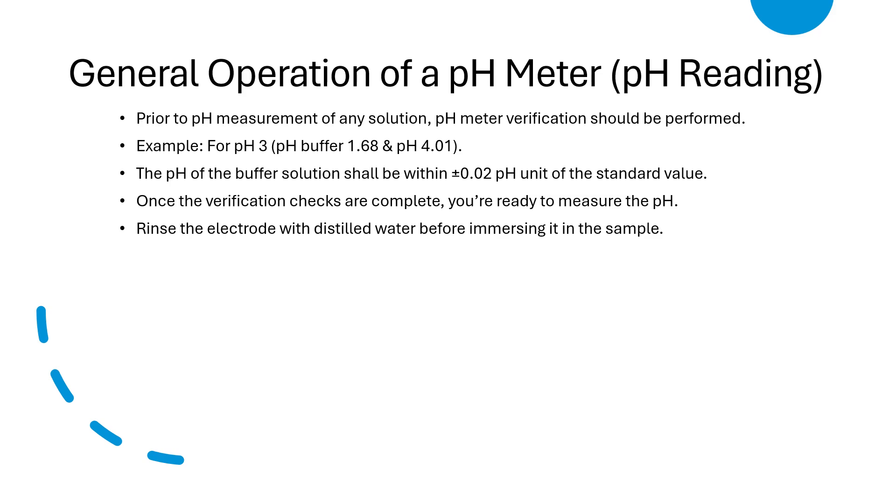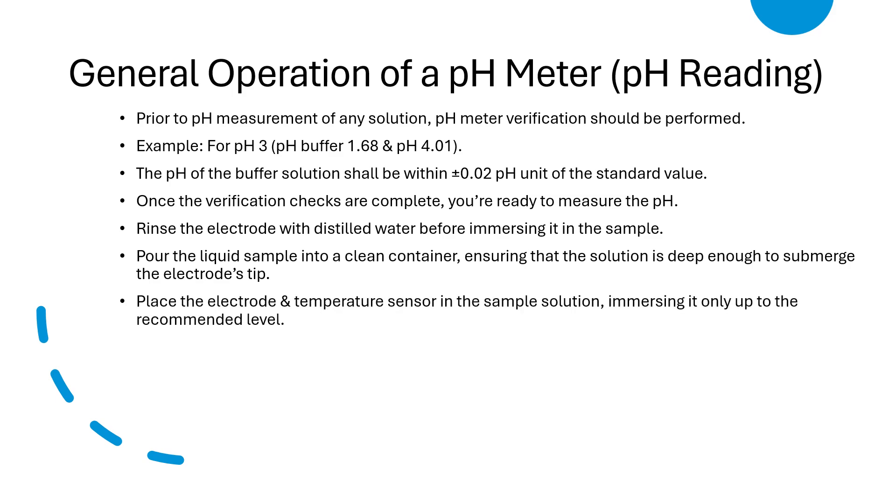Pour the liquid sample into a clean container, ensuring that the solution is deep enough to submerge the electrode tips. That means the electrode should be properly dipped into the solution. Then place the electrode and temperature sensor in the sample solution, immersing it only up to the recommended level.